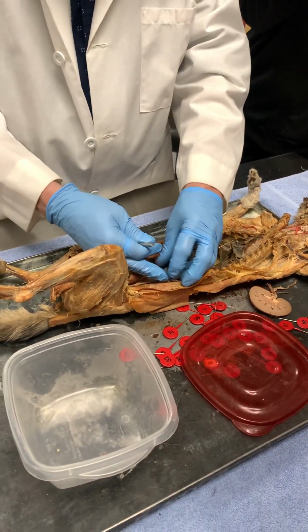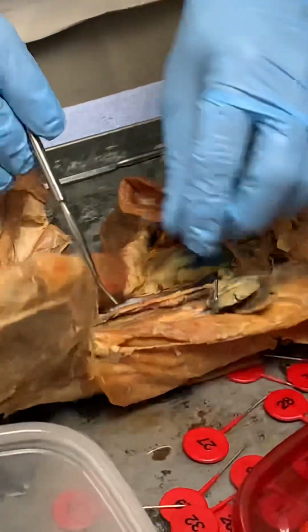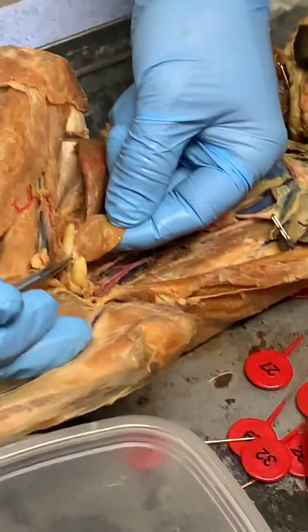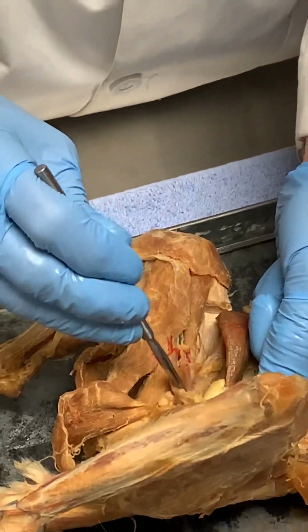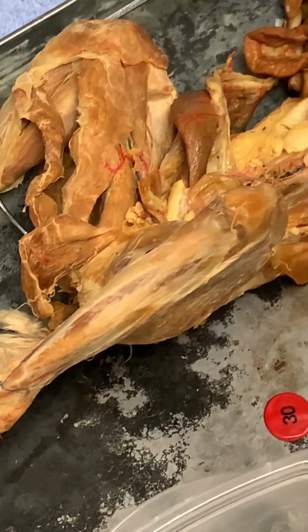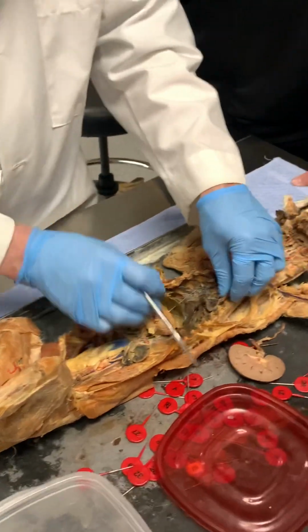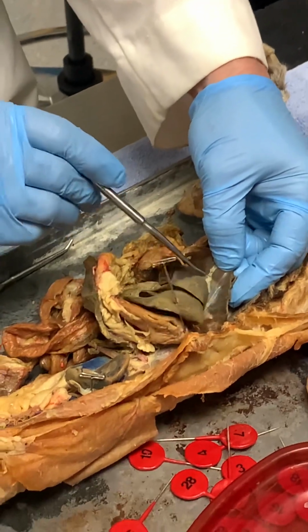So from here, you have the ureters. And the ureters on either side will go to the urinary bladder. Okay. And from the urinary bladder right here, that is the urethra. Let's see if I missed anything here. Diaphragm is up here. That's where the falciform ligament is attached.